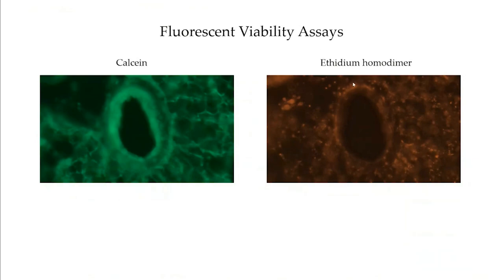But the nice gold standard is if you have beating cilia. So if you looked under a microscope and you had nice beating cilia along the interior, then that implies that your epithelium is quite viable. Your smooth muscle ring should therefore be viable, and you should have contraction. And if you don't have contraction, you'll have to troubleshoot why the slices are not contractile.